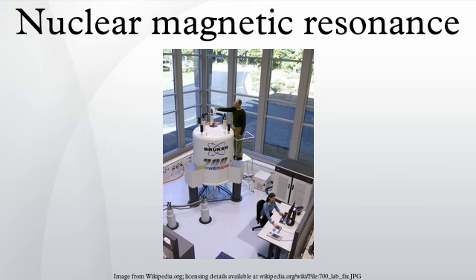Although NMR spectra could be, and have been, obtained using a fixed magnetic field and sweeping the frequency of the electromagnetic radiation, this more typically involved using a fixed frequency source and varying the current in an electromagnet to observe the resonant absorption signals. This is the origin of the counterintuitive, but still common, high field and low field terminology for low frequency and high frequency regions respectively of the NMR spectrum.